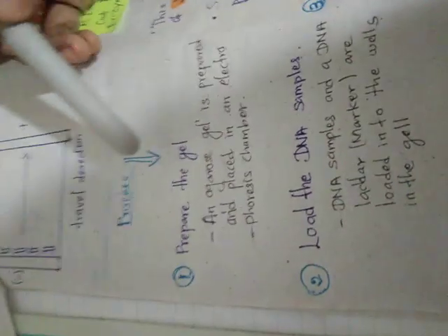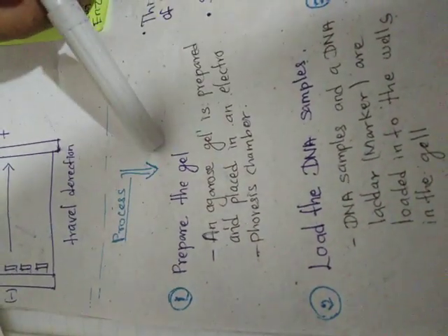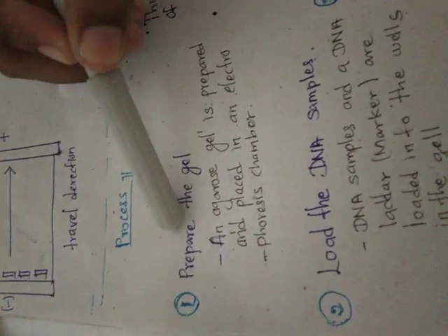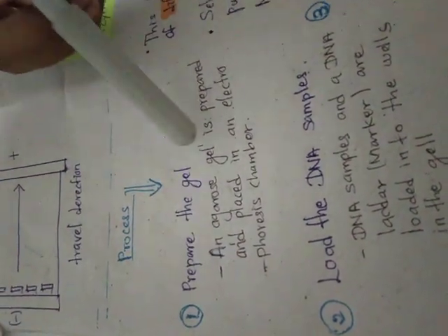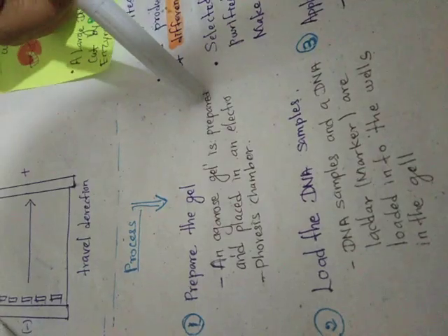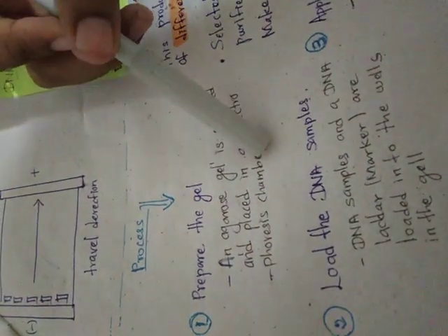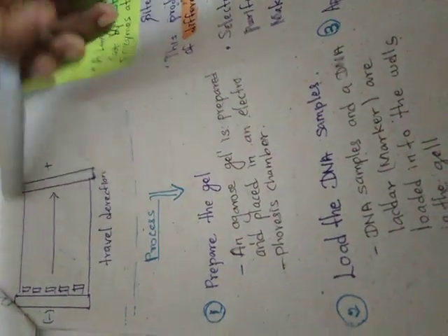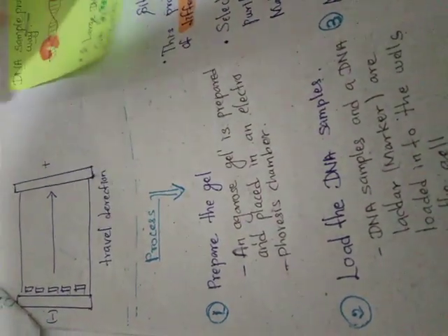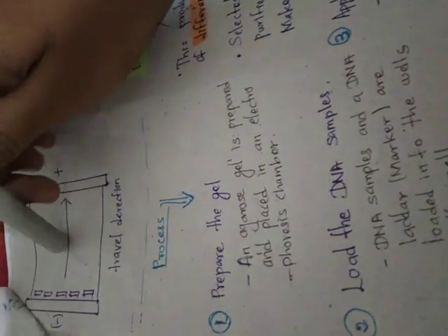So we have to move on with the process. The first process is to prepare the gel. What is the gel? That is the agarose gel. An agarose gel is prepared and placed in the electrophoresis chamber. This is the electrophoresis chamber. So we have to put the agarose gel within this.